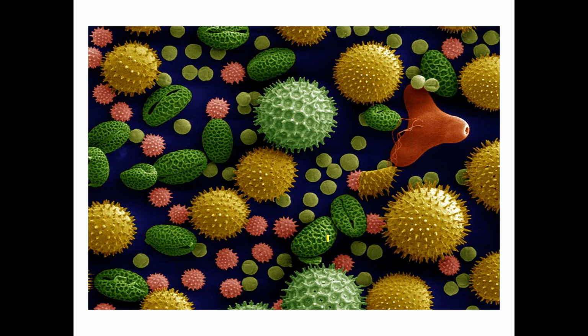Please explain topography. See, now you can see this picture. What do you mean by topography? How the specimen looks like? Topography means, how can I explain, from the picture you can visualize some round bold specimens with spikes.